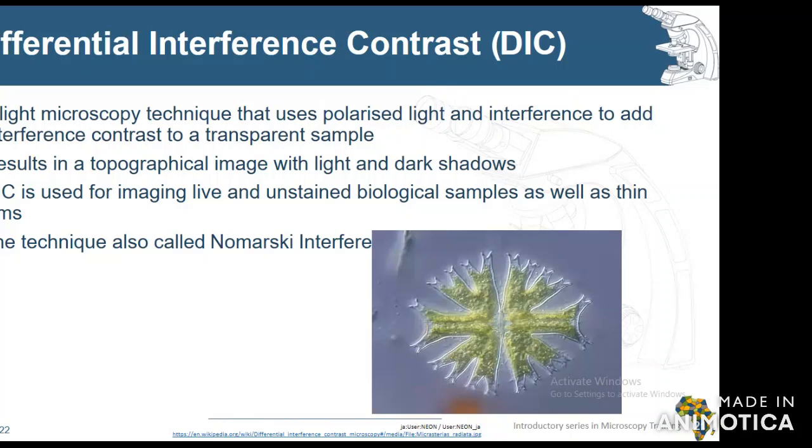After that, a second prism will recombine those two planes and make them become single. It is that single one that goes on into the eyepiece.